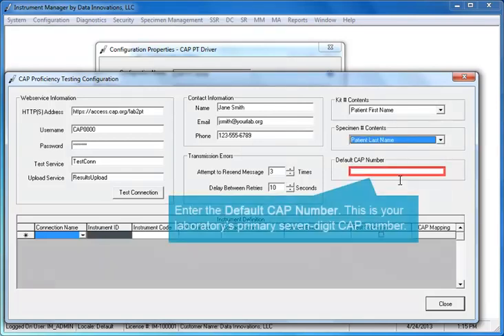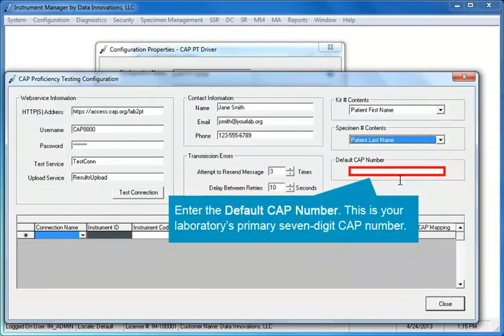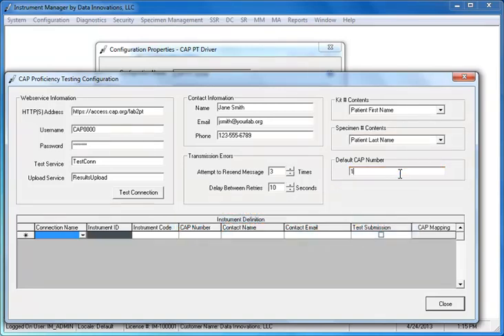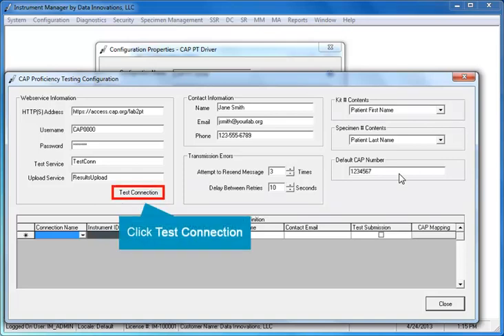Enter the default CAP number. This is your laboratory's primary 7-digit CAP number. To test the connection, click the Test Connection button.